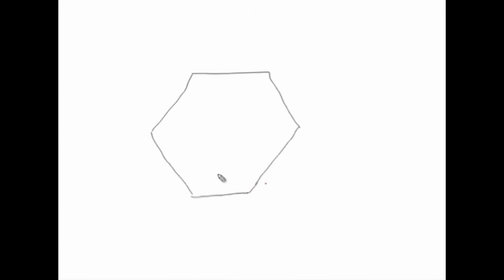Alright, you have 6 legs in here, and in the field inversion pattern, you have the gel loaded in here, and you apply the electric field in 2 directions. One direction is in this direction, another direction is in this direction, that is at 180 degrees.